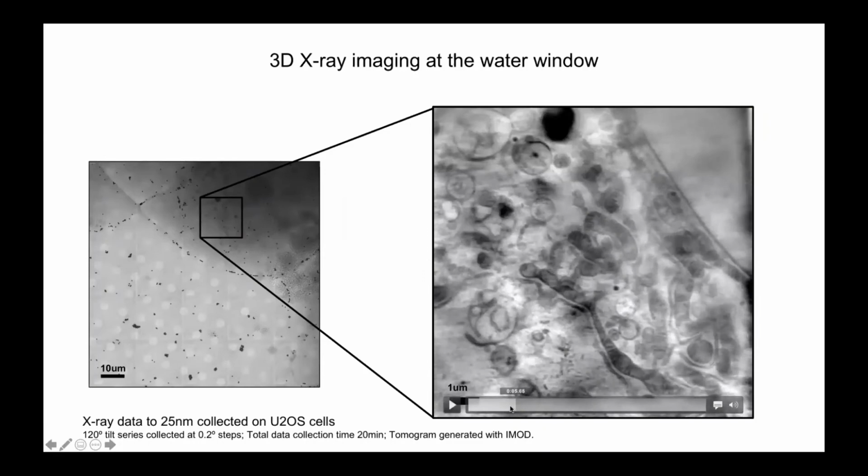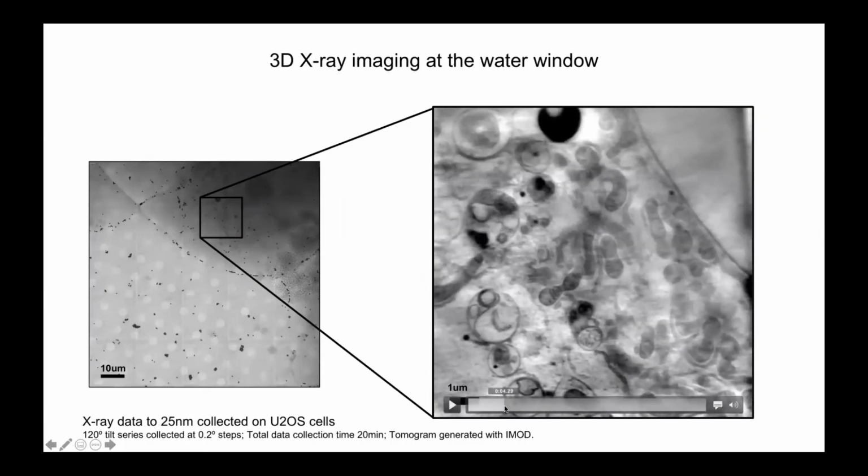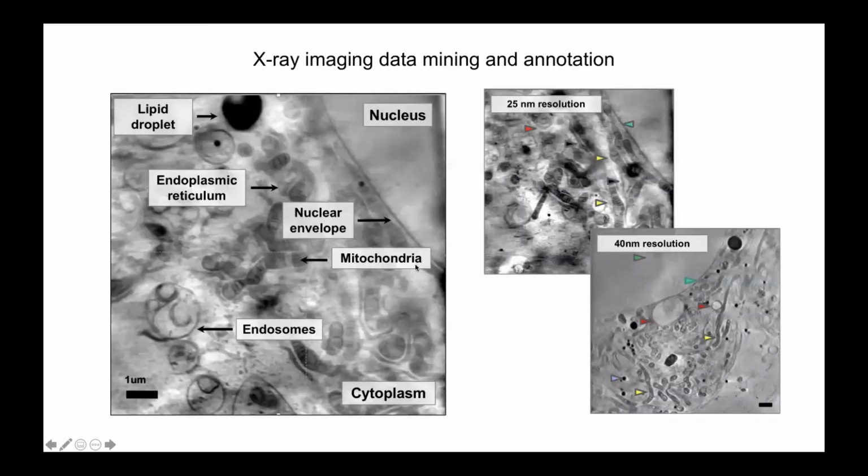Well, you can see very clearly mitochondria, endosomes. In fact, if I'm not mistaken, exactly, I've reproduced it here. So in any snapshot, we can stop and figure out the different components. Here, for example, you see the nucleus, mitochondria, beautiful cristae, the endoplasmic reticulum wrapping around all the structures, endosomes, multivesicular bodies. So depending on the project, this is the kind of information you can harvest.